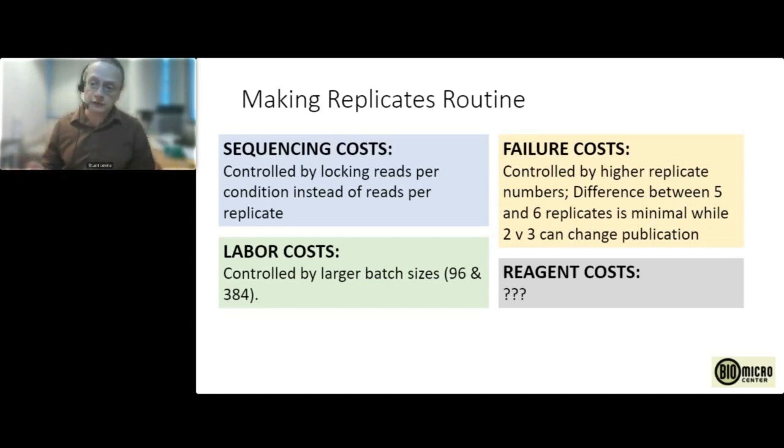Second, labor costs. It doesn't actually cost us that much more to do large batches than it does to do small batches. It's the same amount of time for the technician, even if we're doing a lot of the steps semi-manual.